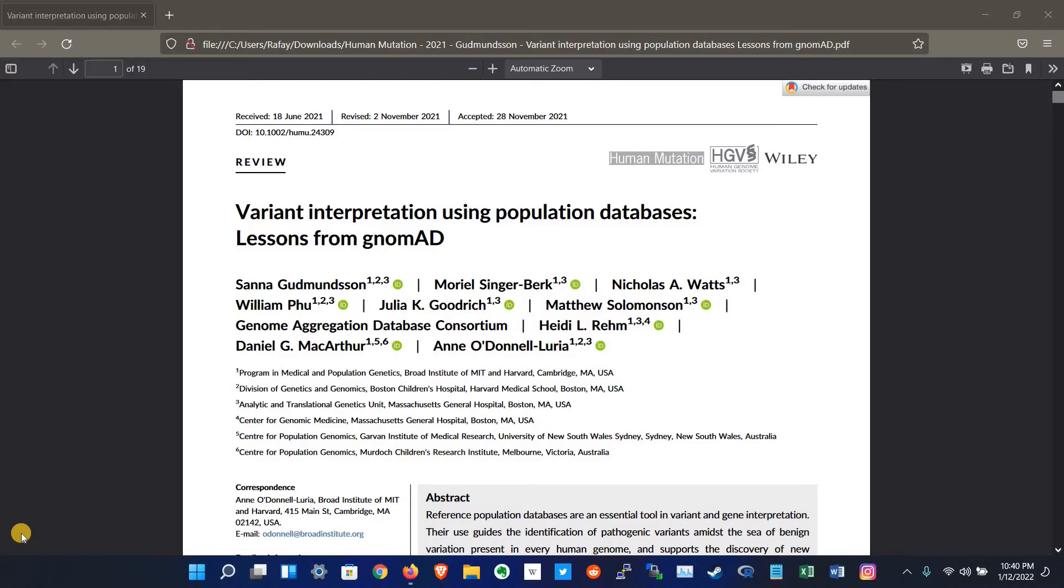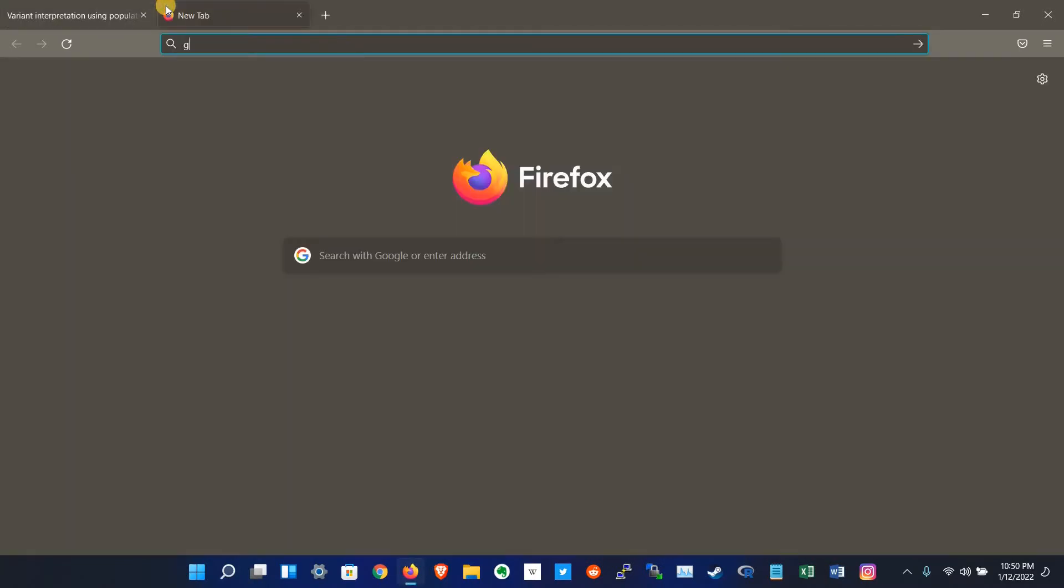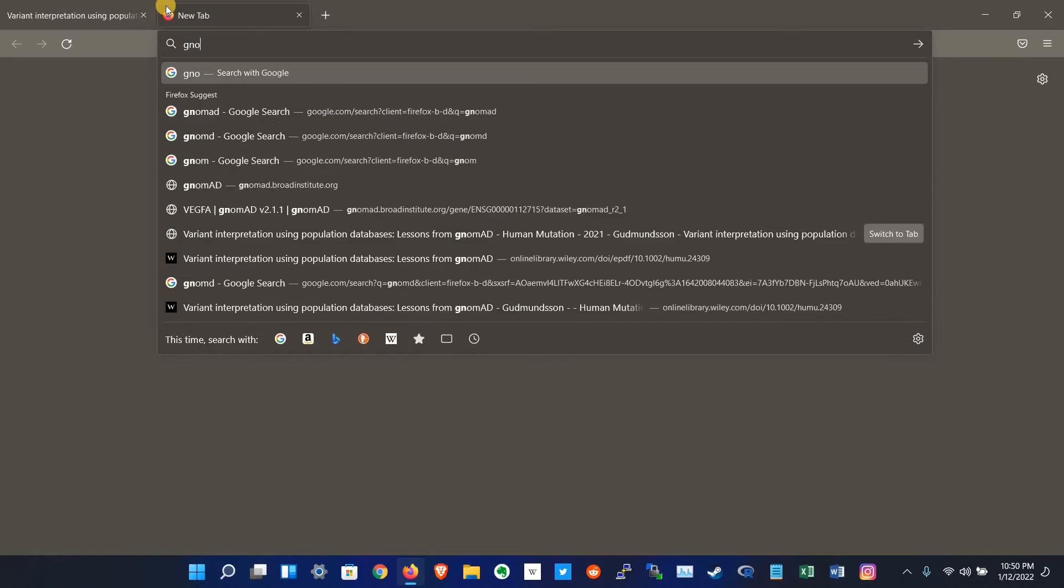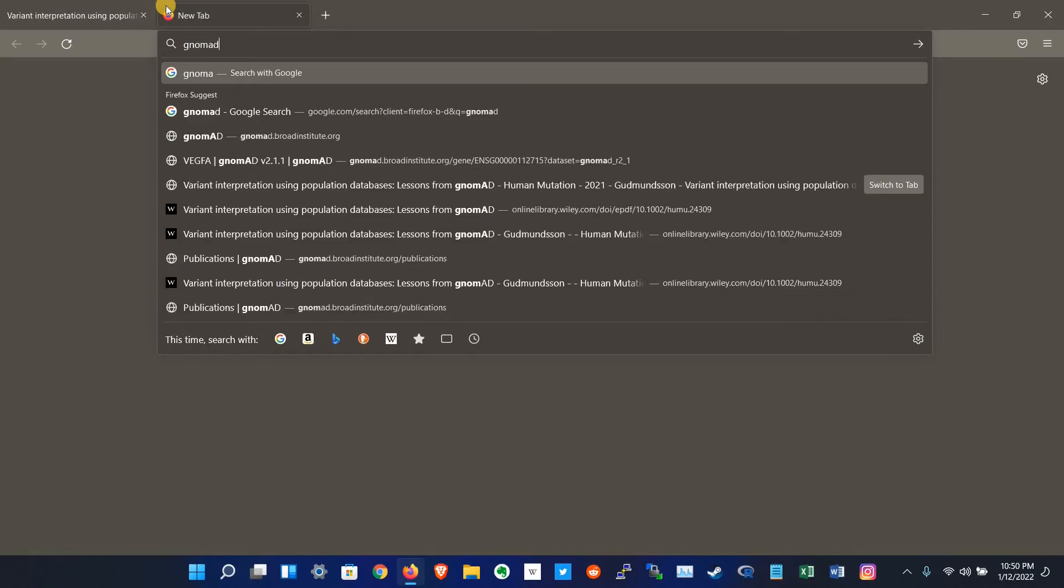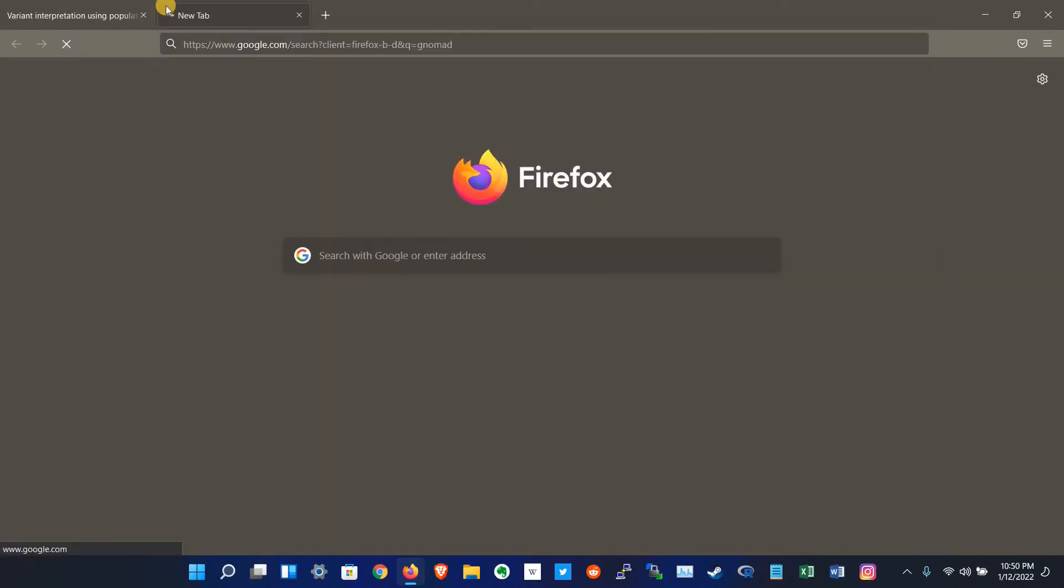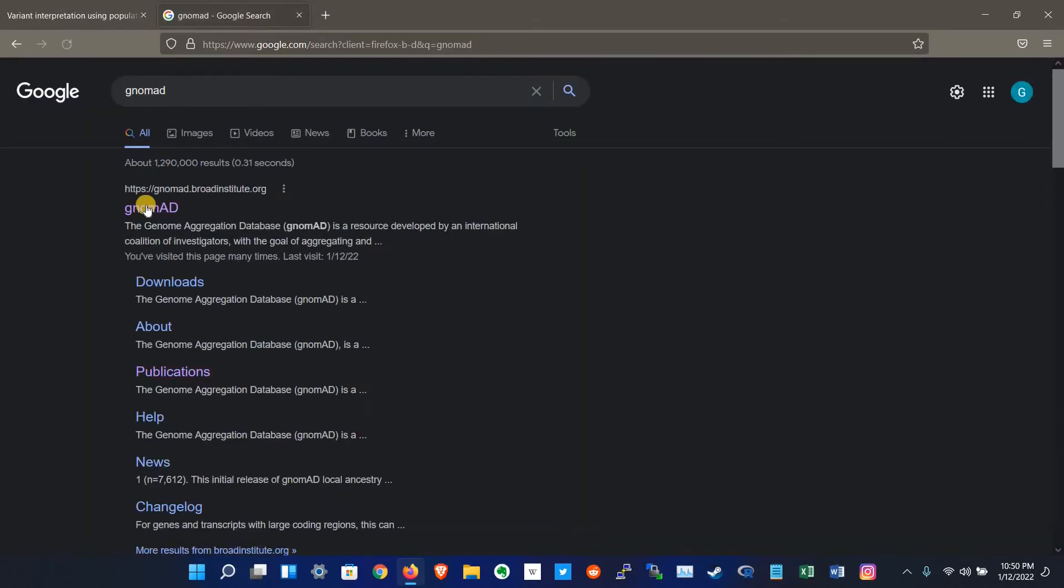So let's get into the gnomAD database. First we have to search for gnomAD on Google. Now we have to click on the first website which is hosted by the Broad Institute.